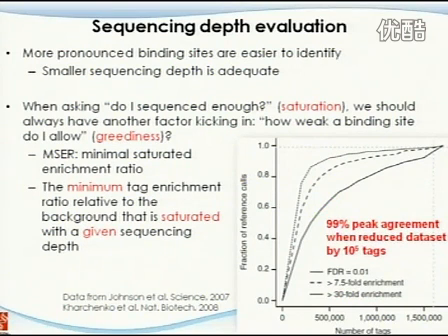But the point is, when you evaluate the saturation, you want to have a better idea how strong the signals of the binding sites you're targeting are. If you're targeting very weak binding sites, you want to sequence a lot deeper. If it's not too weak, a 30-fold difference, and you got only 300,000 reads, you probably already get to the saturation.